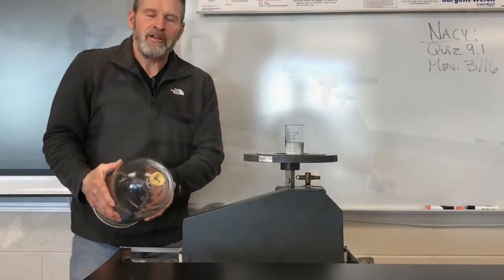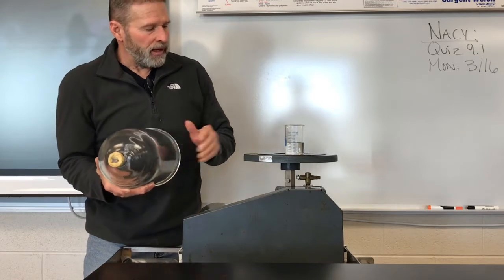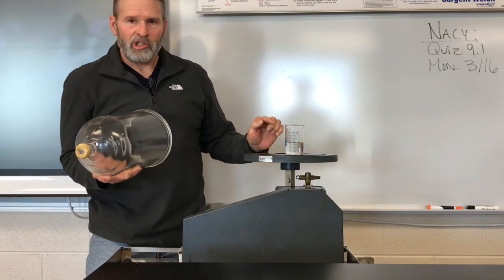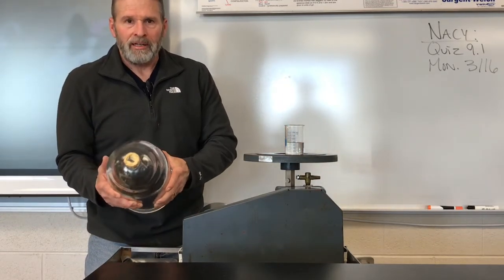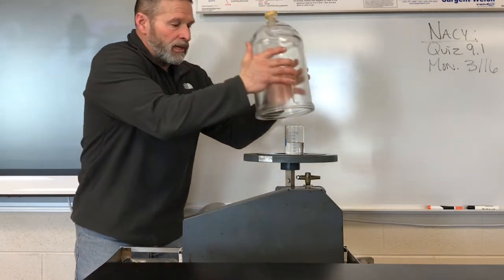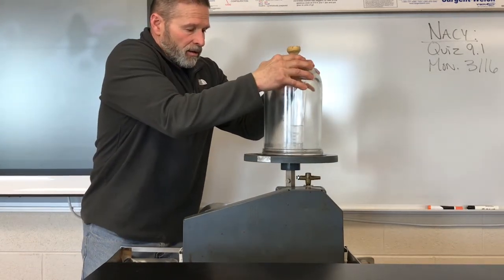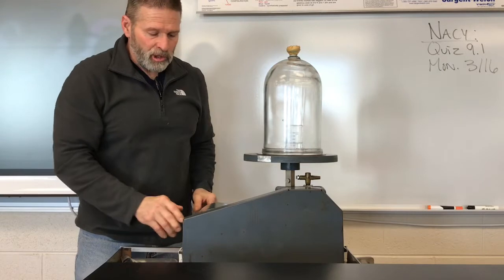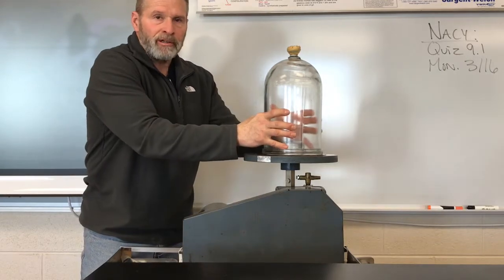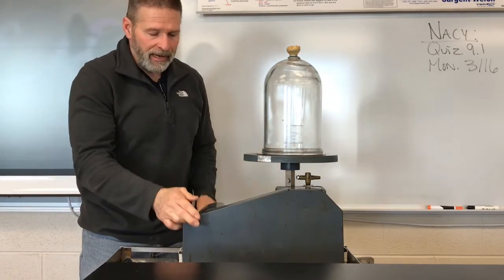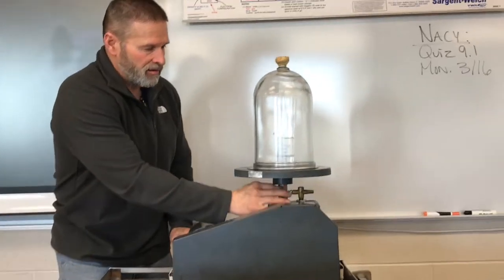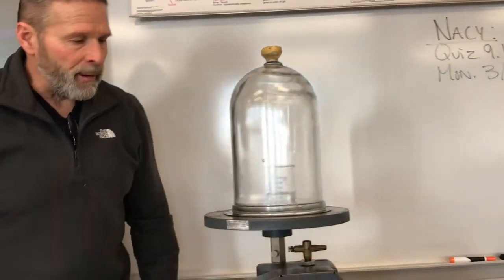All right, here we go. Here's our last vacuum pump demo. What we're putting in there this time is known as tert-butyl alcohol. And this is a liquid that will boil like water but at a temperature much closer to room temperature. So this is room temperature right now. It's around 25 degrees Celsius. And we'll turn the pump on.